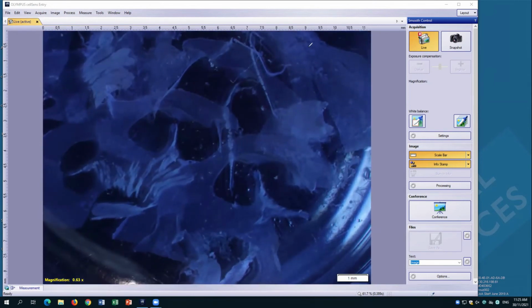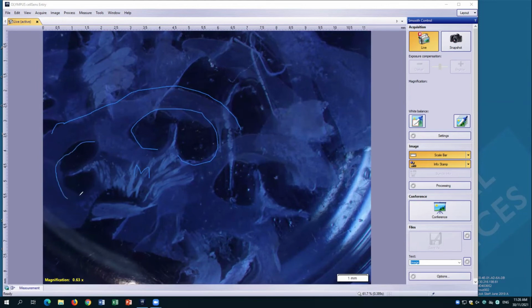So that's another cross-section here. So I might just point out this one here. And there's another section here, so that's a bit confusing. But now you see a cochlear turn here. So this is the modiolus, outer shell of the cochlea. There's another one that's quite typical of the diagram. So you see this chamber here on this side. Let me clear and draw it again. So you see the modiolus, and this is the external side of the turn. So this is the cross section of the turn.